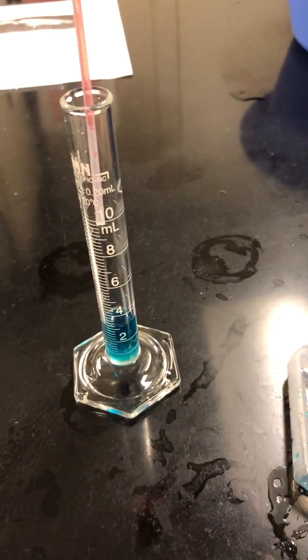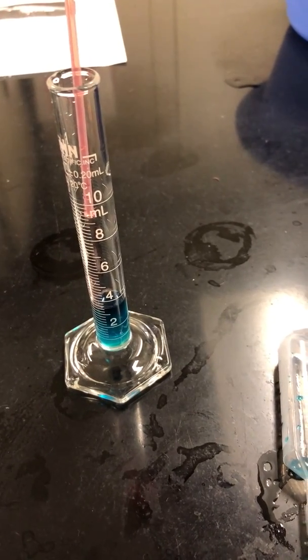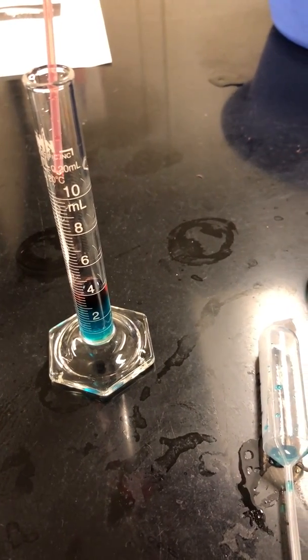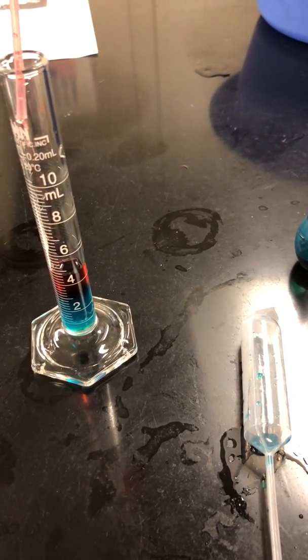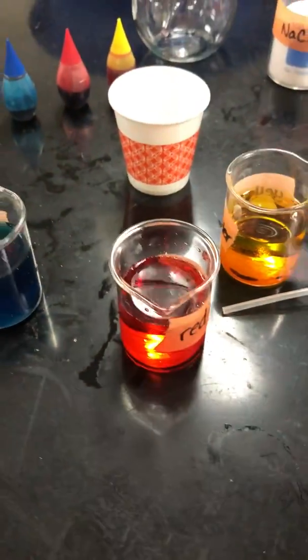Now here we do have to go slow. I did have some kids go too fast. It was fun, but they literally just mixed them both and had purple, so. Patience is the key. There you go. And again, there you go.